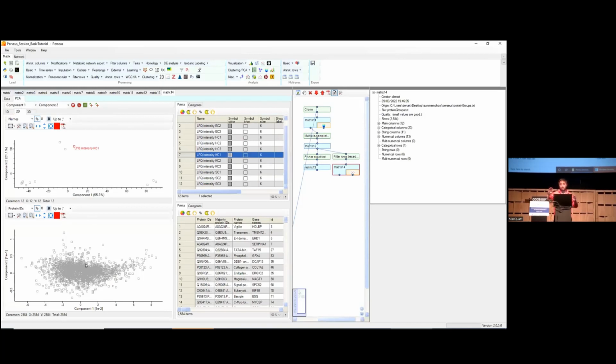And then when you plot these axes, both the x-axis and y-axis are the axes in which your covariance matrix is diagonal, which means they are the axes with more variance. So these are the axes or the proteins that have more variance, let's say.